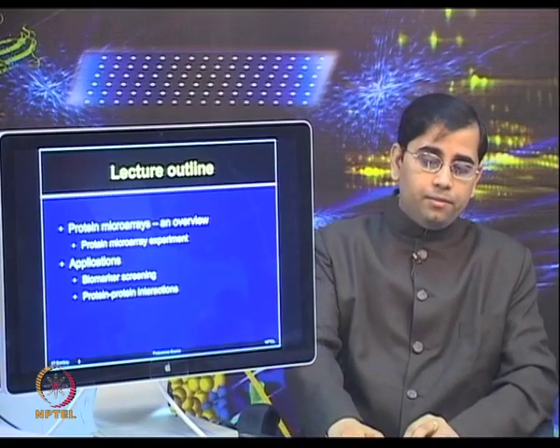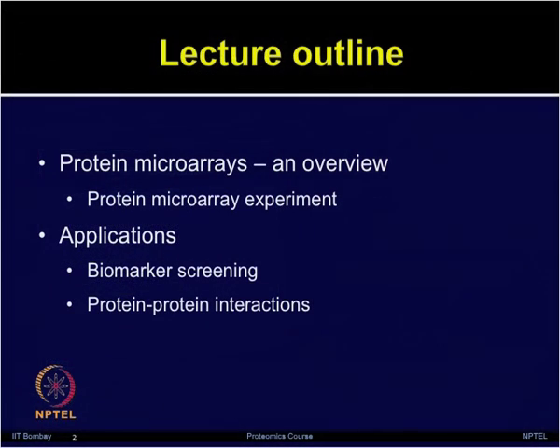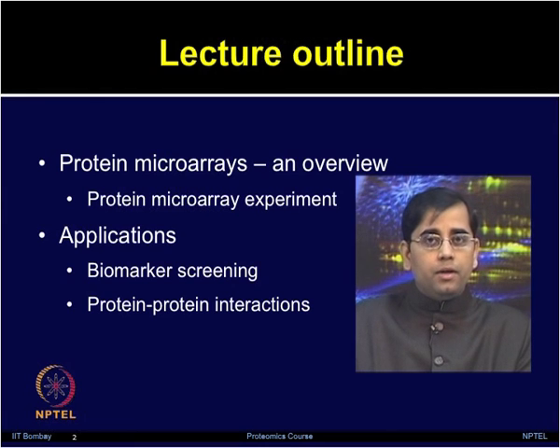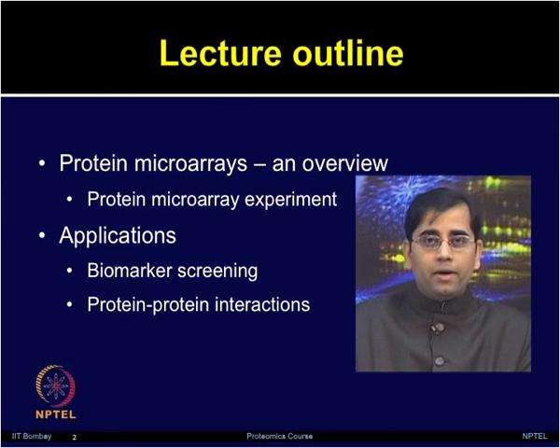In today's lecture, first I will give you an overview of protein microarray technology, which we have already discussed in the previous lecture. I will then give you an overview of how to perform a protein microarray based experiment, which in general can be applied for any type of application, whether you want to study biomarker screening or protein-protein interactions.